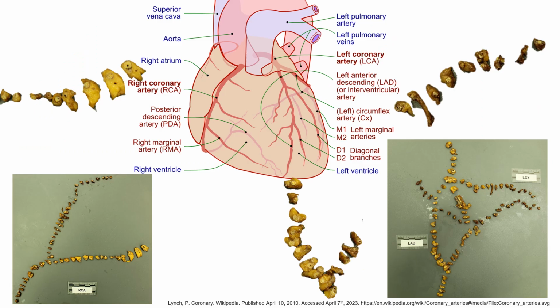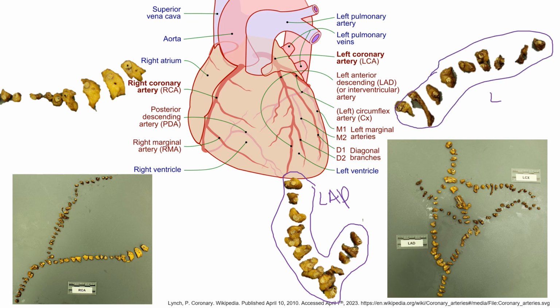We can also switch up the way we dissect things with a blunt dissection. So focusing in a more traditional way, these are a bluntly dissected left anterior descending artery, a bluntly dissected left circumflex artery, and a bluntly dissected right coronary artery. And what I mean by bluntly dissecting, because traditionally you don't want to cut these open, is you're getting underneath the vessel and reflecting it off the heart, and then we put them in decal.